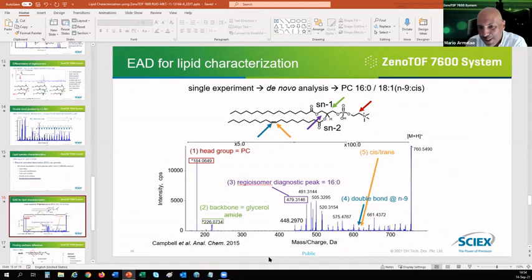Yeah, that's a very common question because, of course, we can acknowledge that the evidence is here. We are acquiring, we have the spectral evidence, which is the starting point. And of course, being EAD, most of the systems were not prepared to process this type of fragmentation, so that required a little bit of adaptation.